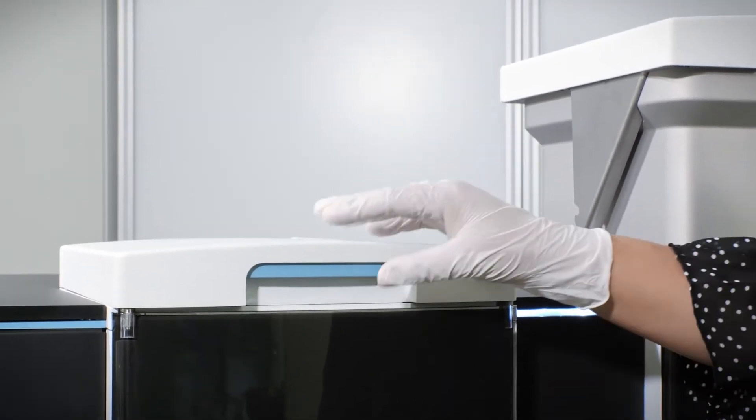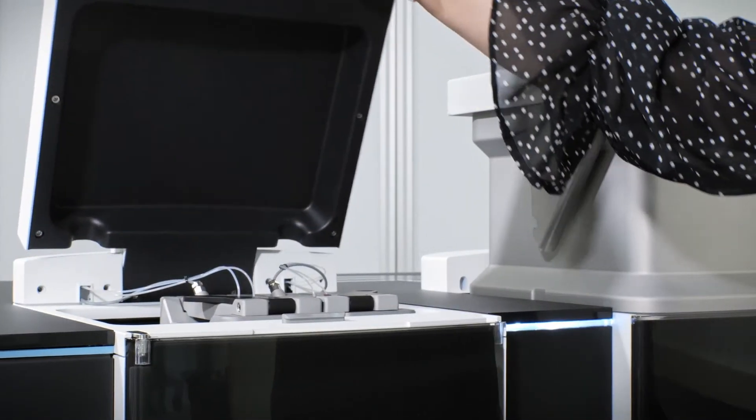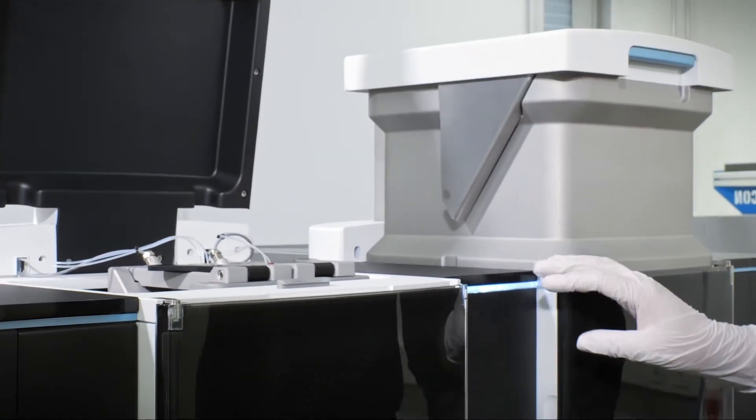Veranome's system's sophisticated software means that once configured and loaded, the system offers full walk-away automation.